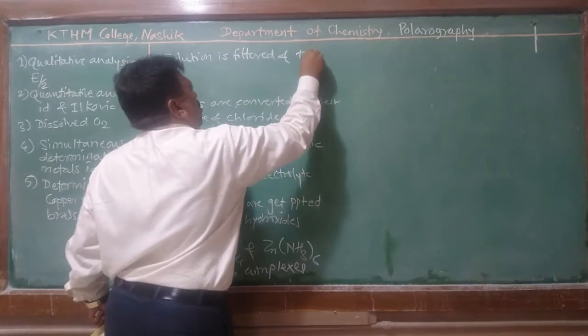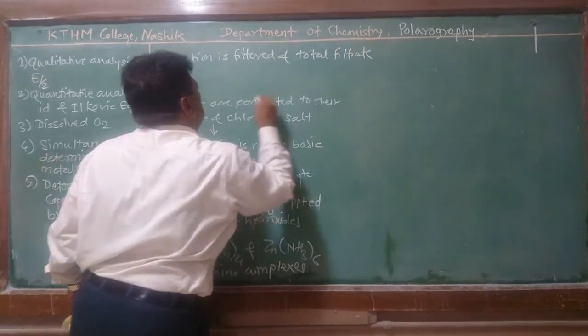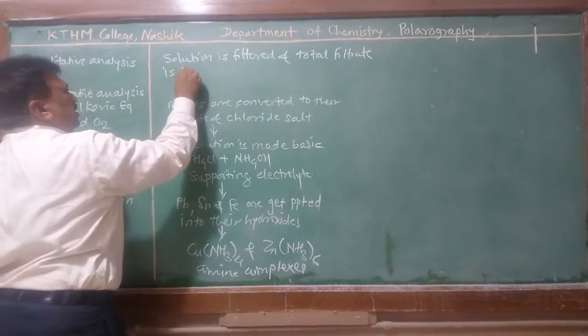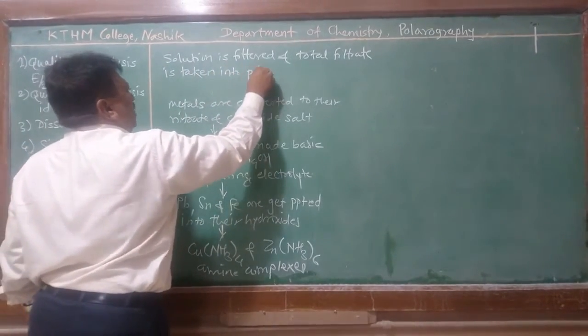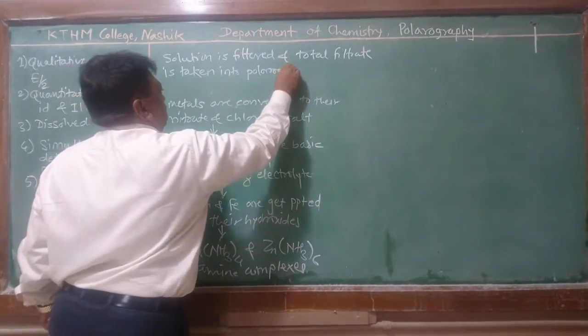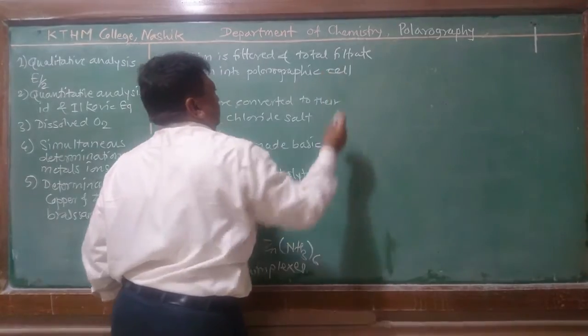And the total filtrate is taken into a polarographic cell.